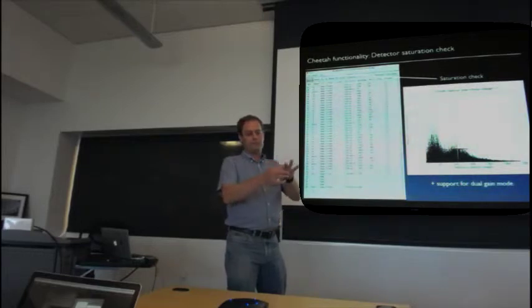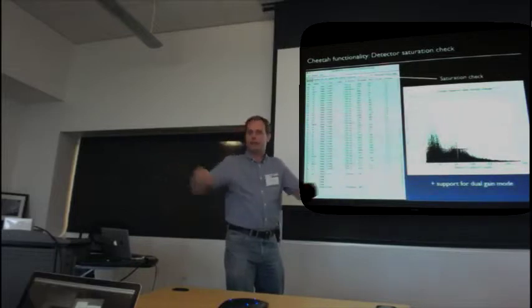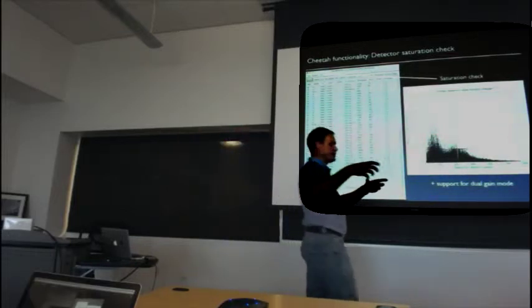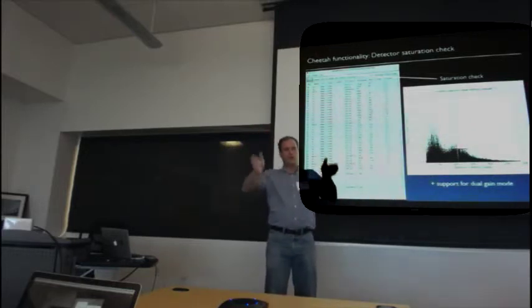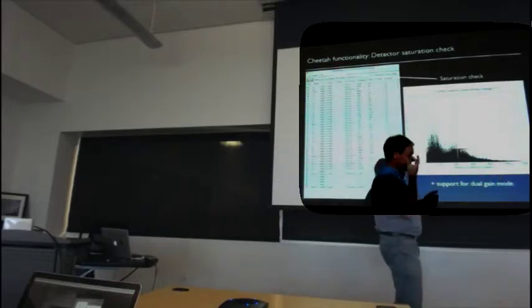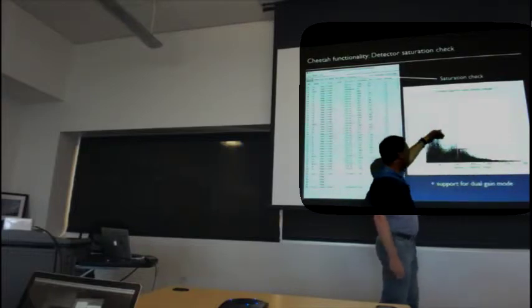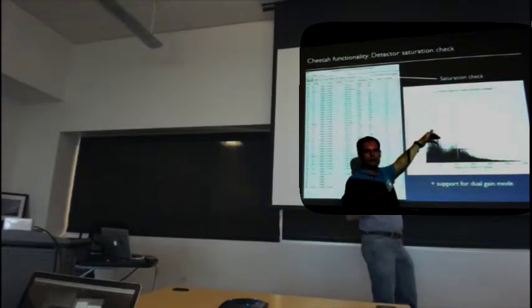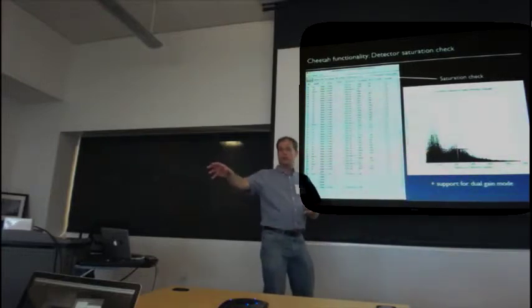On a CCD device, if you fill up one well, the charge spills over into the neighbouring wells, and you can actually integrate it to still get the total amount of photon energy deposited in there. With the way the CS pad has very steep sides to the wells, you fill it up, and what happens is it just says, it was more than this. I've saturated. I don't know how big it actually is. That, of course, ends up causing problems for the analysis, because if you run it to get your high resolution peaks out here and you have nothing but saturated peaks at low resolution, this is going to affect your data analysis. So it's very useful to be able to quickly say, is my beamline attenuation good enough that I'm actually getting reasonable measurements at low Q and at high Q?